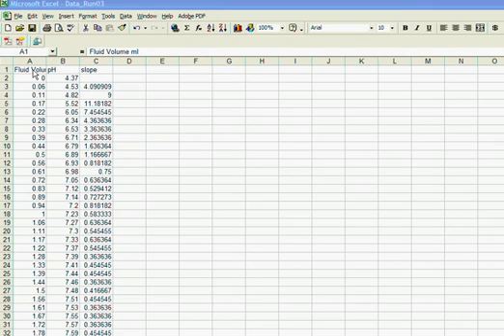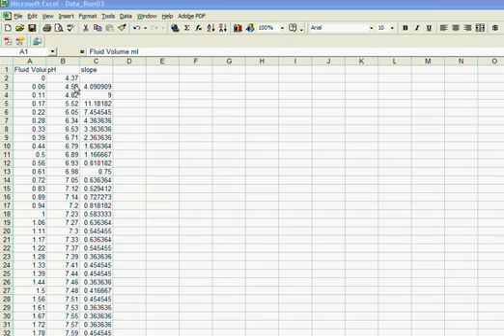Already I have my basic titration data, my fluid volume, how much base was added versus the pH of the solution, and from that I've already calculated the slope of the titration curve.